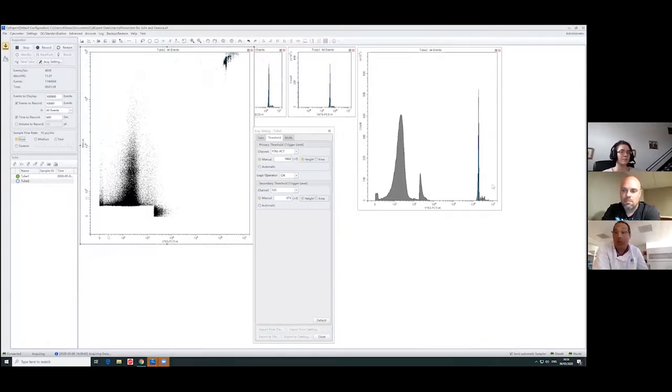One is the coefficient of variation. And the other thing you have seen is that it's dropping on the fluorescence, so the median fluorescence intensity will also change. So we don't want to go too low, we don't want to go too high, we want the perfect dilution. Goldilocks, just right. We want to make sure that we enhance our dynamic range and keep our signal to noise ratio as good as possible. By making everything wider, you limit that dynamic range, as Alfonso was pointing out.